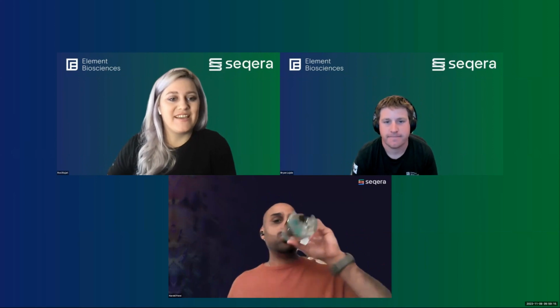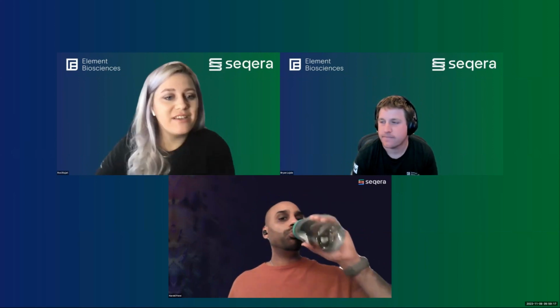Okay, great. Very interesting. And then Brian, maybe you could speak to us a little bit more about that MultiQC. What am I going to learn from using MultiQC with Bases2Fastq? What metric can I get out of that? And maybe when will that be available too?